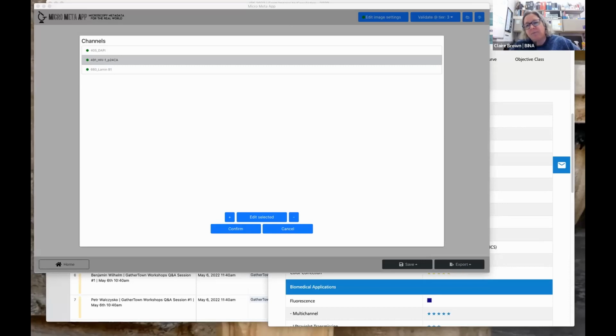And one last question, Michael was asking if you've talked to Thor Labs and whether they might be more likely to buy in earlier than some of the other microscope manufacturers. Thor Labs is one of the companies we're talking to, and we definitely see that smaller companies are very interested. A lot of what they do is along this line. So yes, we are working with multiple companies, and Thor Labs, I'm pretty sure, is one of the ones we are talking to.